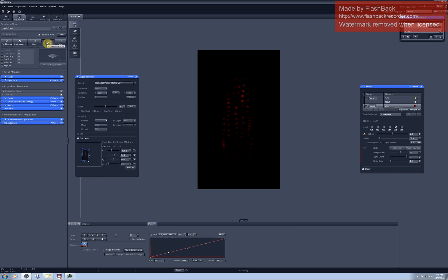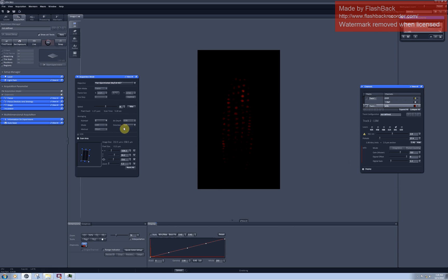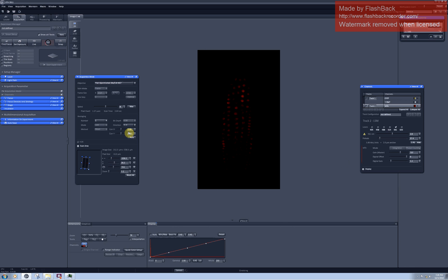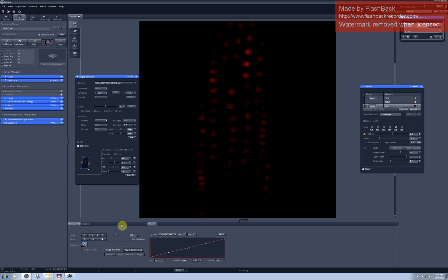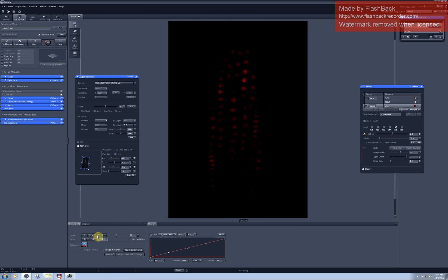You can also see that currently I'm using single directional scanning which actually takes twice longer than bidirectional scanning. So when I switch to bidirectional now I have only 2.6 seconds per frame to scan and there is no loss in quality of image.